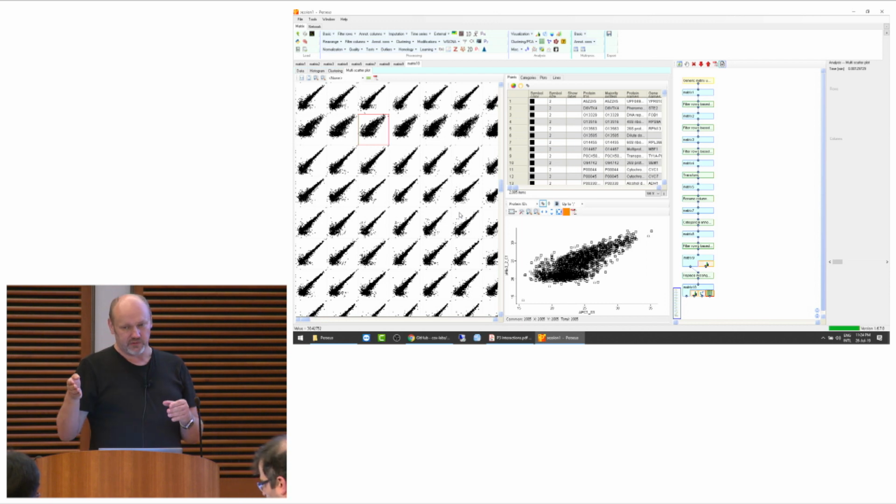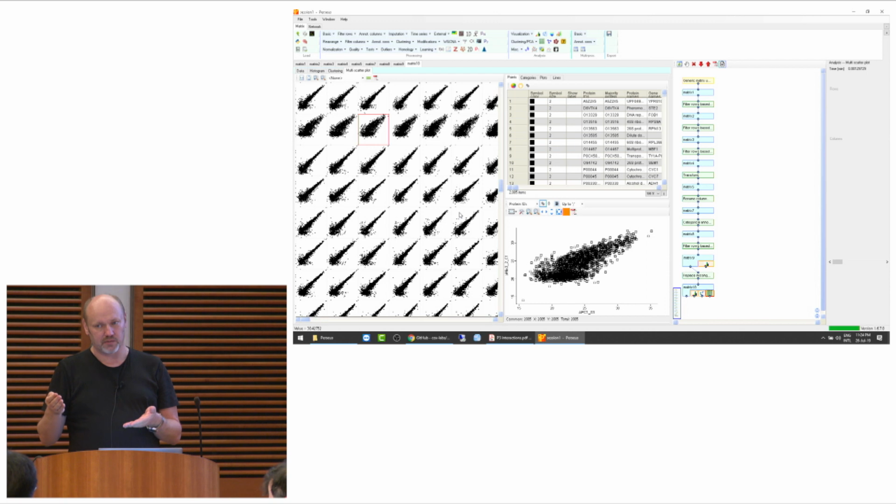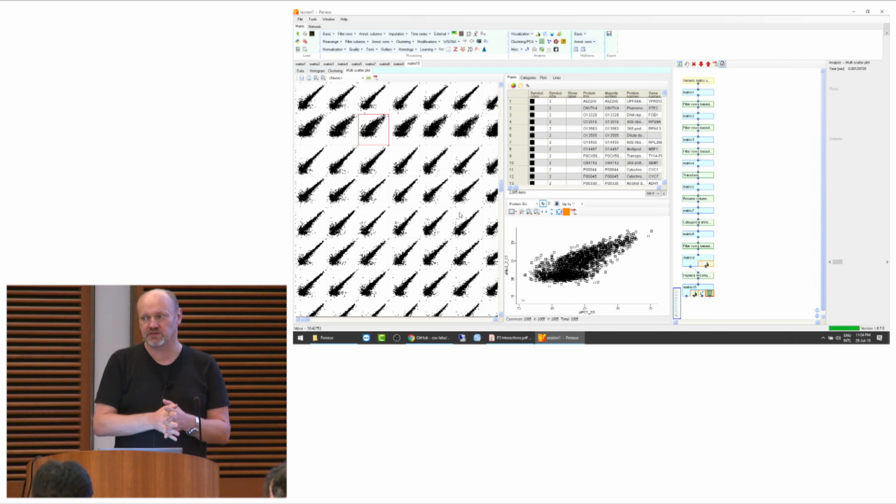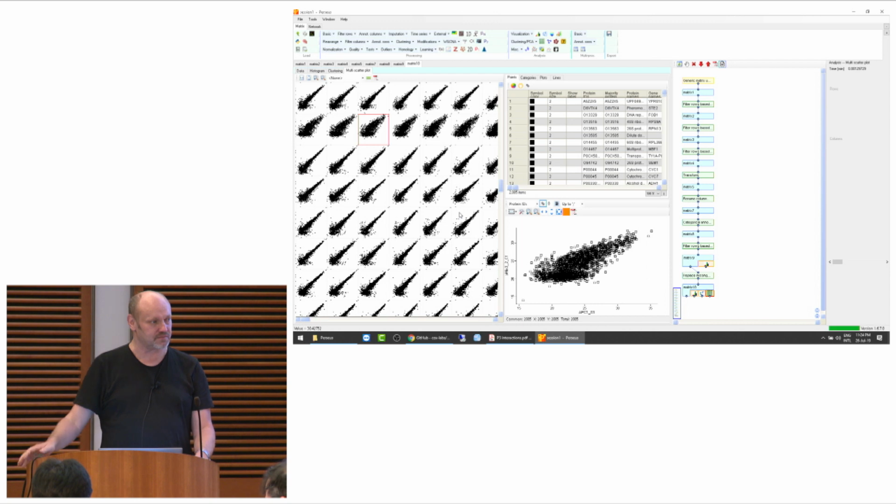So that are reacting basically in a similar way, but it might be on completely different expression levels, and also the amplitude might be completely different. If they show a similar profile, they have something in common, right? So for all expression proteomics purposes, you would first do z-scoring of rows. For pull downs, you wouldn't, because then you actually delete exactly the information about if this is a clear interactor or not, basically.